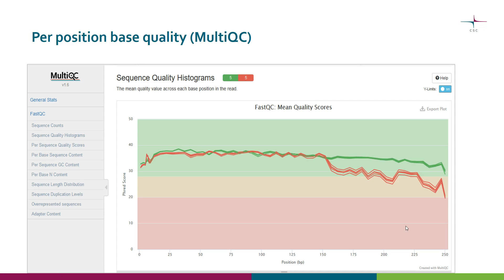Let's have a look at some examples. Here we have a MultiQC plot showing per-position base quality across 10 FASTQ files. According to MultiQC, five of them are okay and five are not. On the x-axis we have the base position in the read — these reads are about 250 bases long — and on the y-axis we have the quality score. You can see that in some FASTQ files the base quality remains high across all positions, whereas in others the base quality deteriorates towards the end, which is typical for Illumina sequencing.